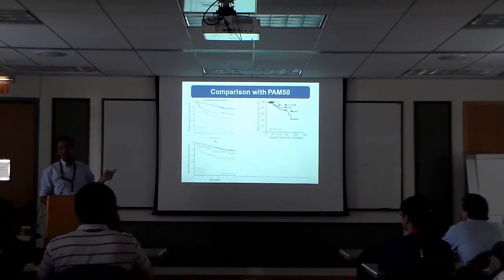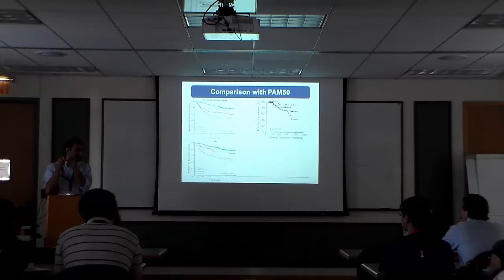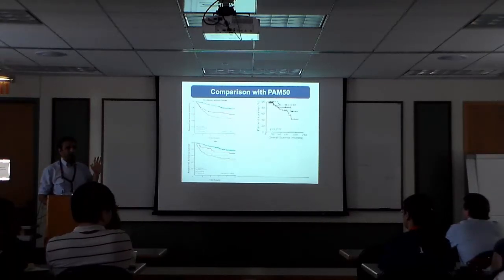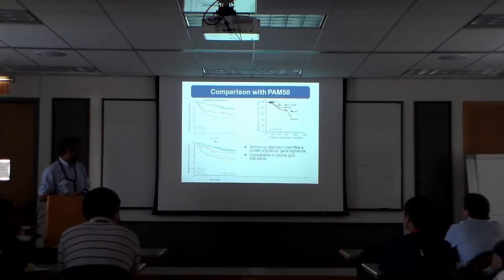So if you were doing this without using infrared spectroscopy in your lab, if you were just a molecular biology lab, you would miss that very small window. You would perhaps be over here where lots of changes have now happened, or you might be over here where you say, well, there's no influence, right? So there's a very narrow window that you have to get this right in, and that's really the trick why this works. We still have to prove it, but I think that's why this works, okay? So that's perhaps the reason why people missed it before.